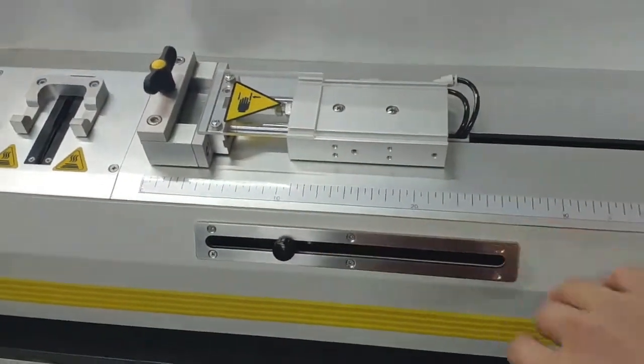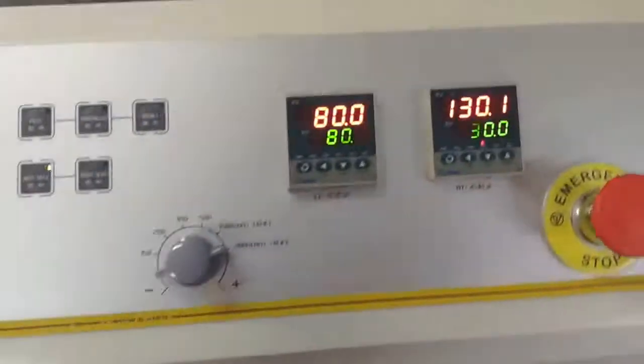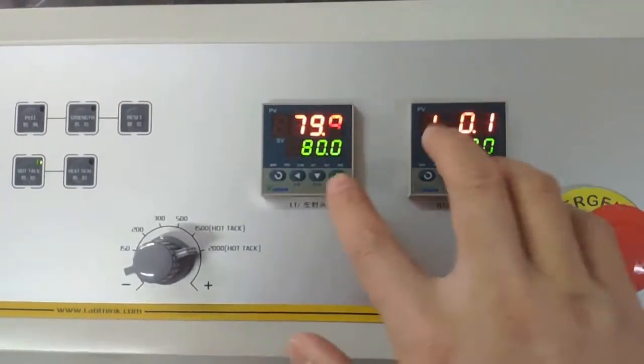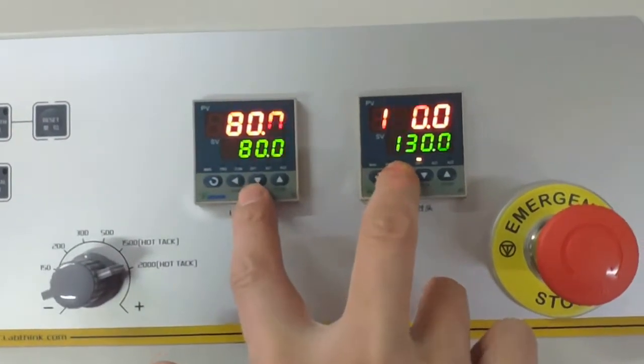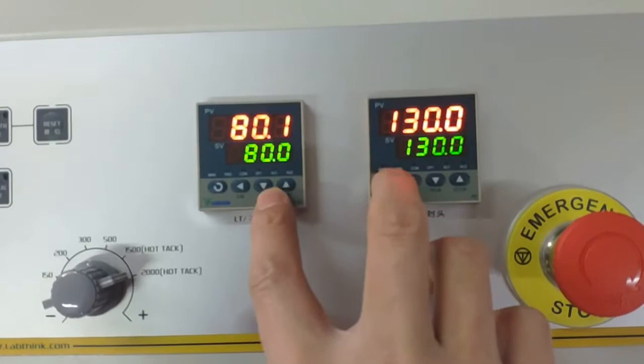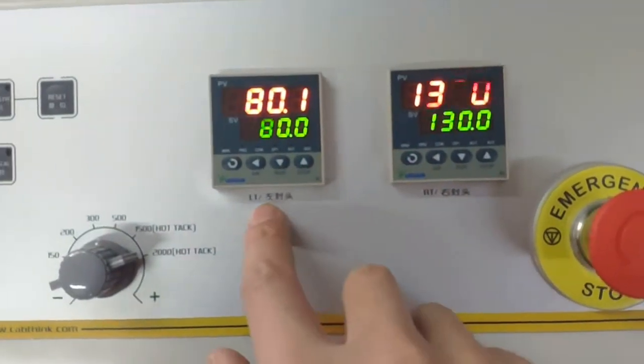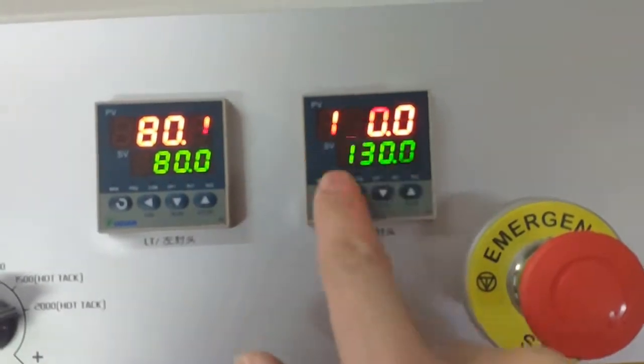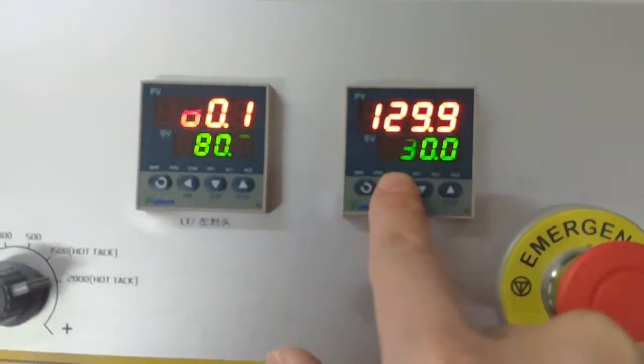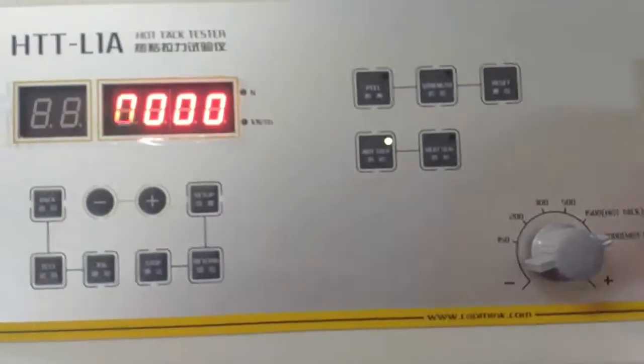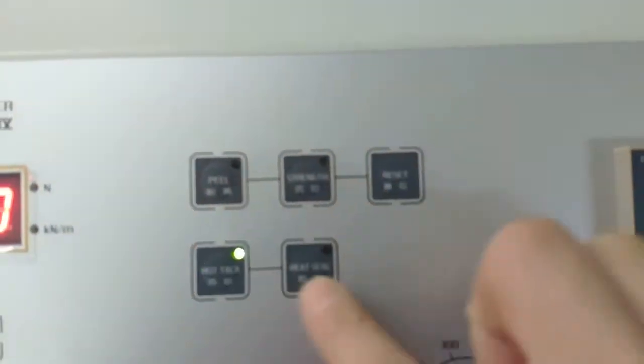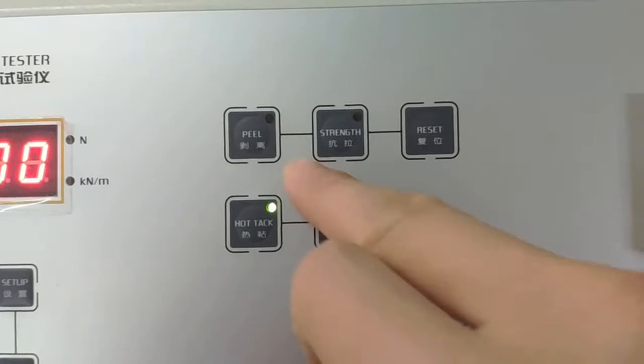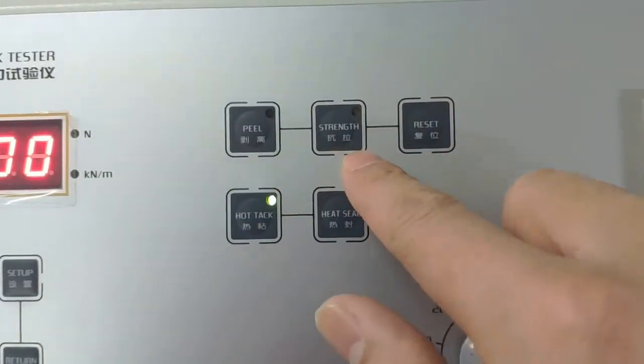Here is the limit switch part, just in case of accident. This is the emergency stopper, and here are two temperature controllers. With these two accessories you can do temperature control. Here is the left seal and the right seal. This is the main heat seal jaw.